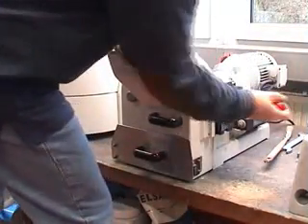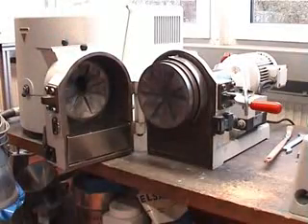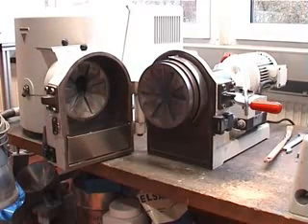When I open the mill, you can see the two discs. First of all, one fixed disc at this side and one rotating disc at the other side, connected to the motor.